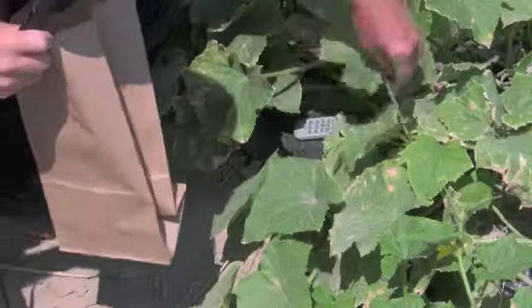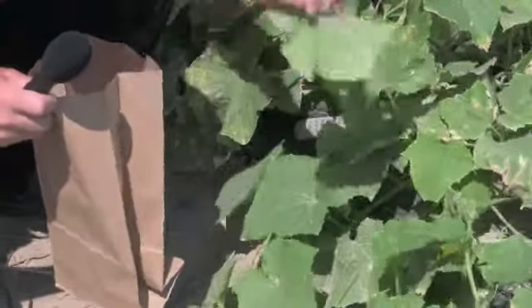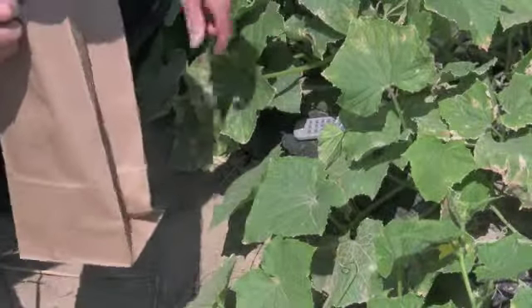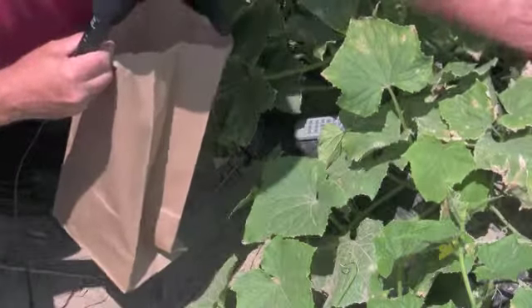It's a good idea to get as many samples as you think are necessary. In this case, I'm going to probably pick about 10 or 12. And I would take them from various parts of the field so we have a good idea of the extent and what the actual problem is.